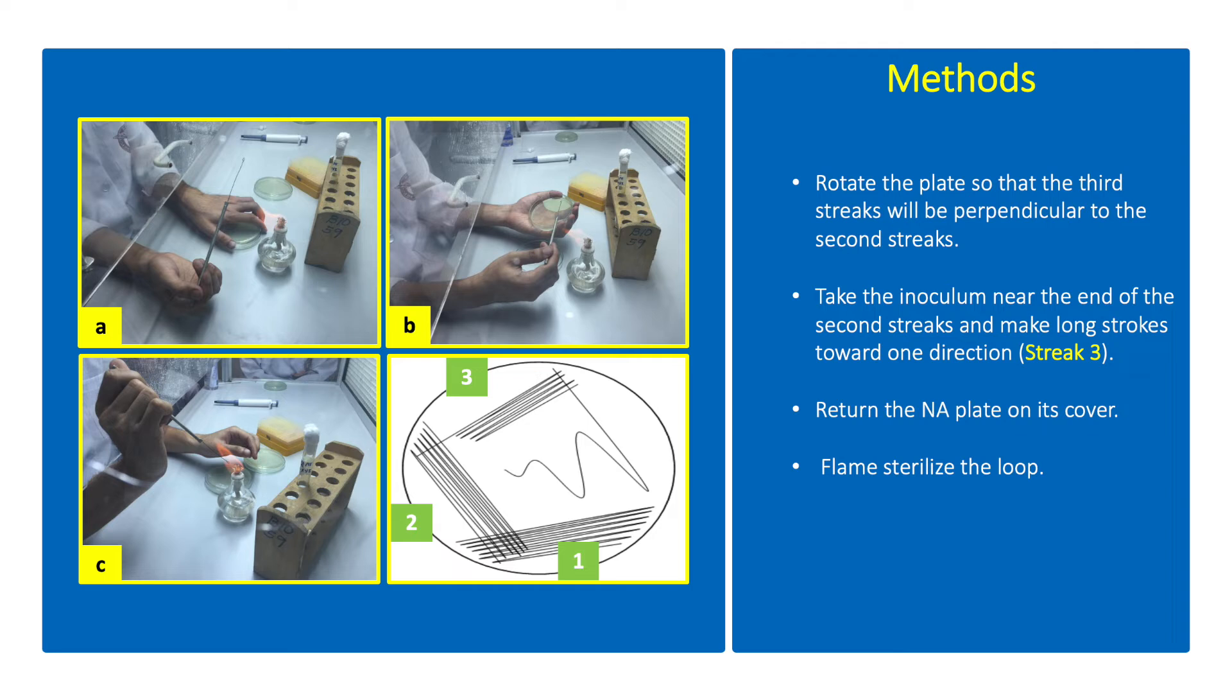Rotate the plate so that the third streaks will be perpendicular to the second streaks. Take the inoculum near the end of the second streaks and make long strokes toward one direction. Return the NA plate on its cover, then flame sterilize the loop.